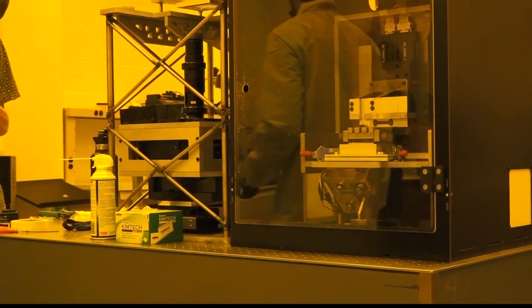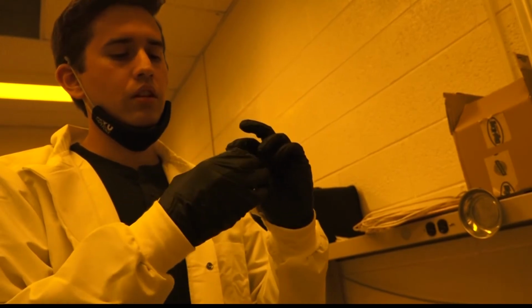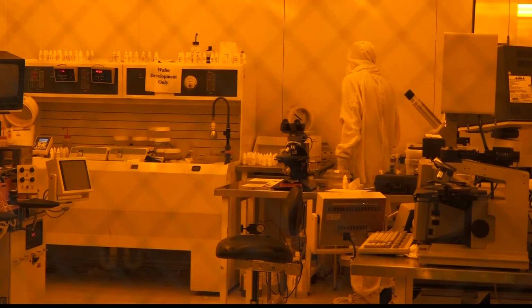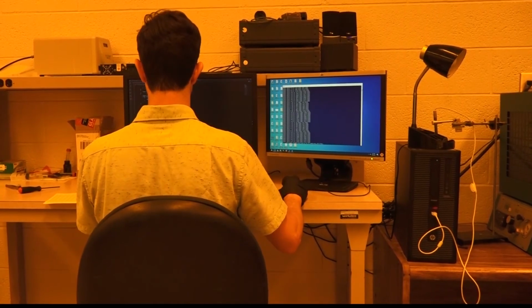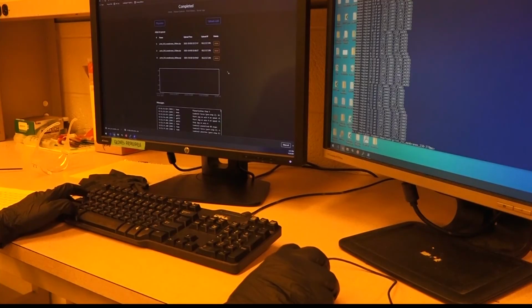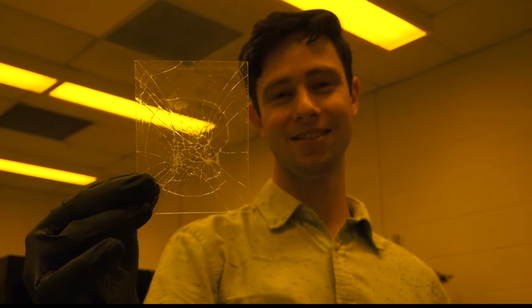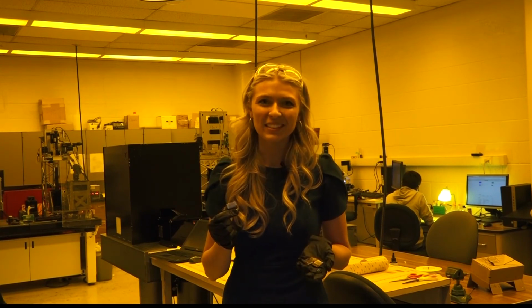The aim of the lab is to revolutionize the process of making chips that previously required a room that eliminates dust particles that damage the chip. Ultimately, what we'd love to do is see many universities and research labs and companies get rid of their clean rooms and replace it with 3D printing. So our aim really is to revolutionize that whole space. Although these chips might seem very small, they're an open door for the science and medical fields.